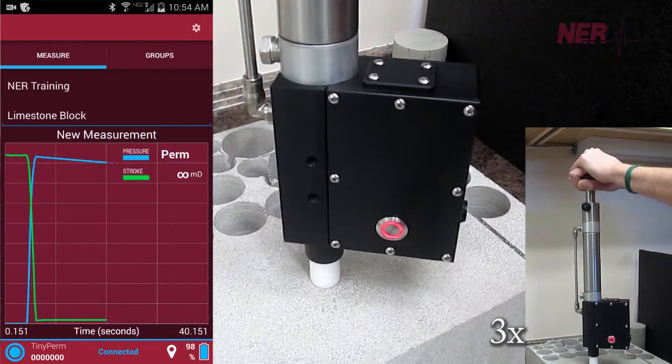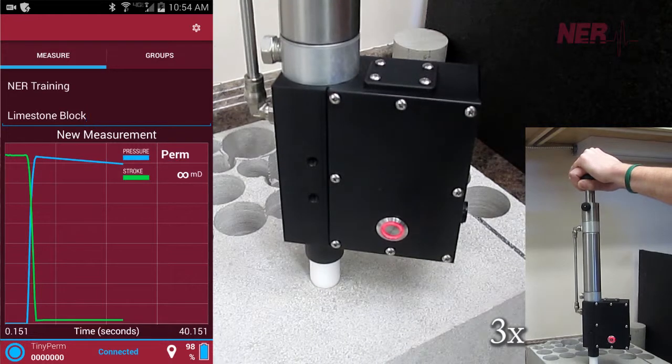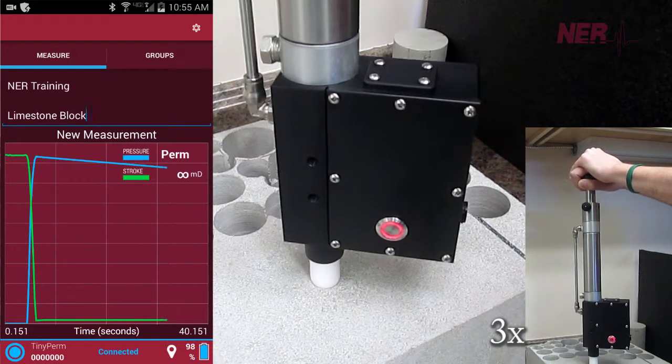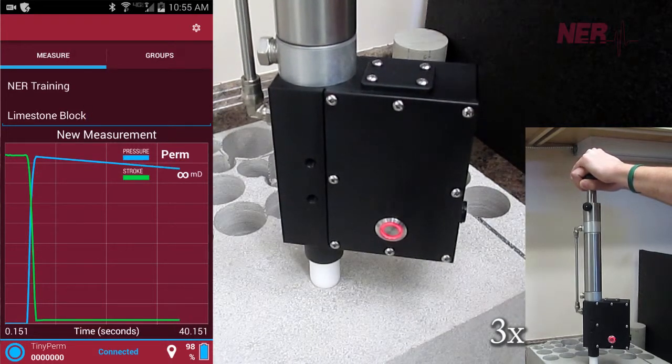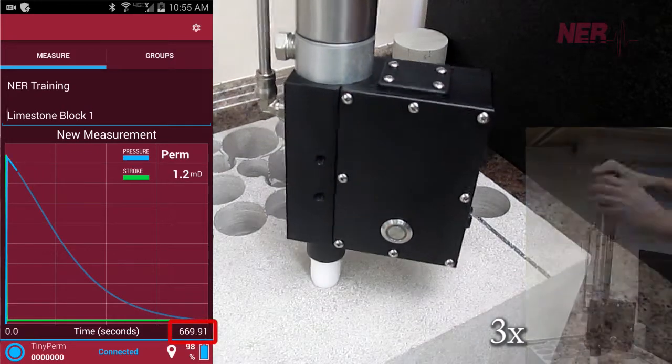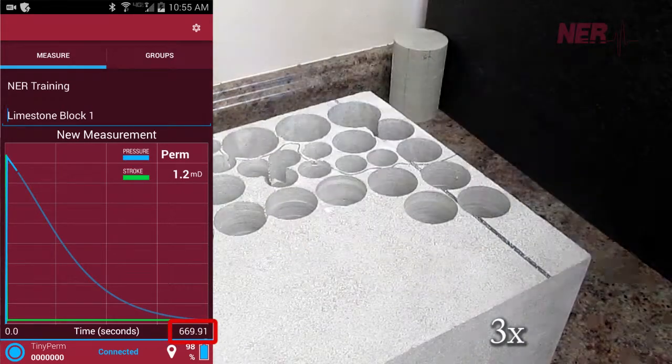Here, we run a test on a block of Indiana limestone. As you can see here, a full measurement would have taken close to 700 seconds.